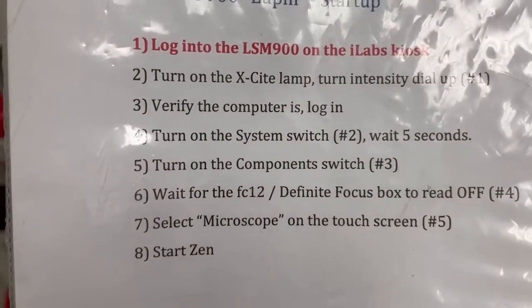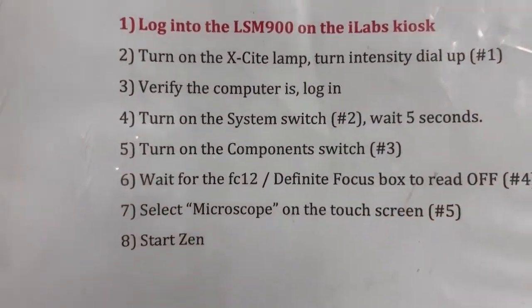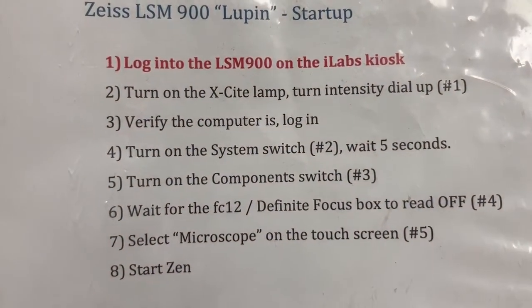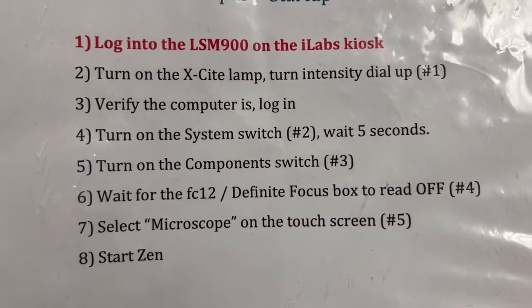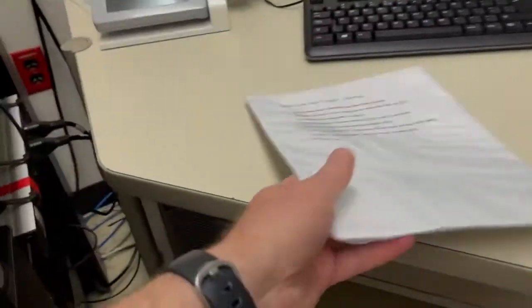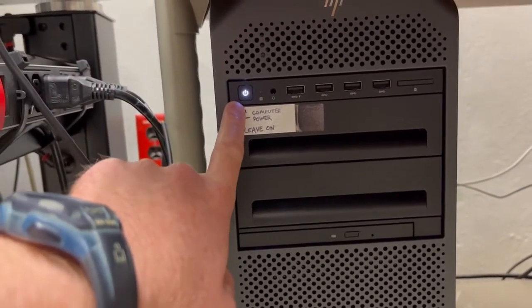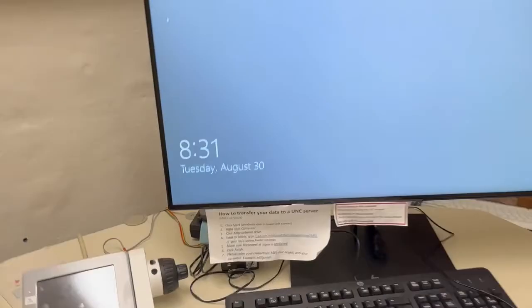The next step is to verify that the computer is on and log in. This computer should always be left on. You can see it is on, the monitor is on. If for some reason you find that the computer is off, the on/off button for the computer is down here. Press that button — it should be on, which is the case today.